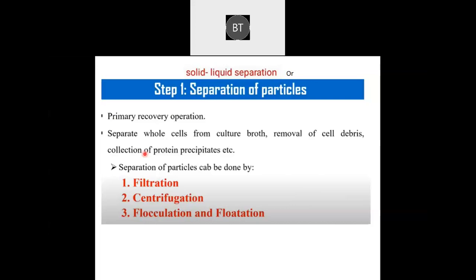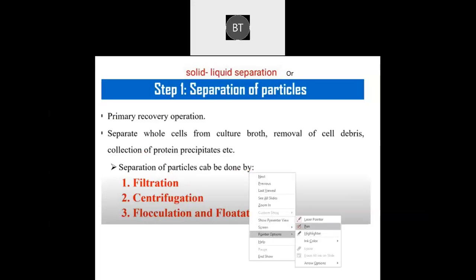As I told you earlier also, some of the metabolites are produced within the cells of the organisms, so they must be released from the cells before subjecting to the solid liquid separation. So let me write it and explain to you all.